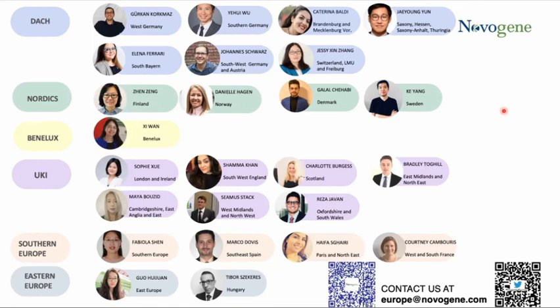Samar Elarbani asks, can the correlation and PCA analysis be used for single cell data samples? As it's his understanding that there's no FPKM in single cell RNA-seq. I think they are asking about the 10x single cell RNA-seq. So for the PCA analysis, if I recall correctly, it is included in the 10x single cell RNA-seq analysis, because from that they can identify the major principal components to separate different cell types.